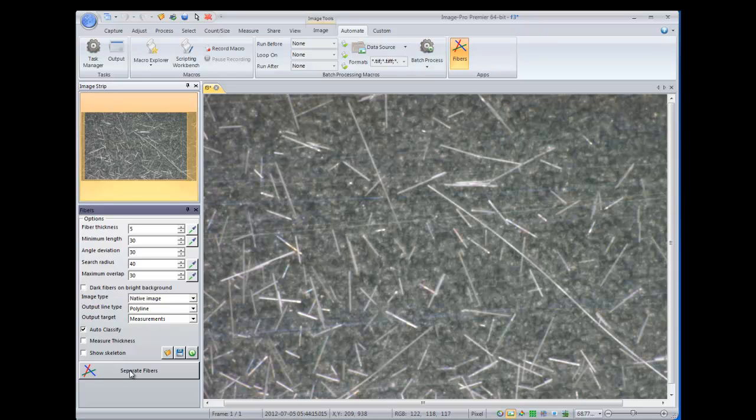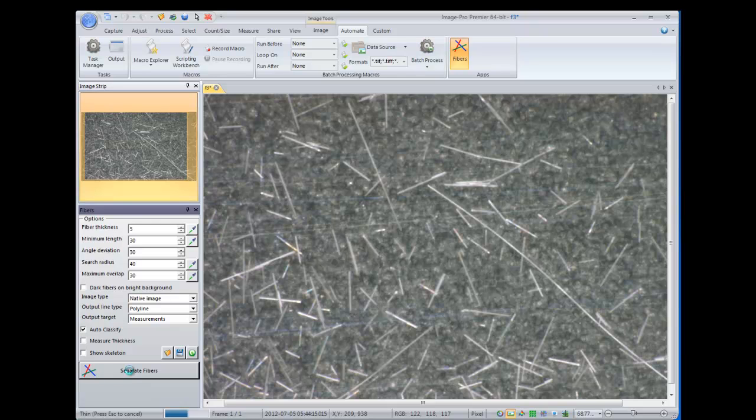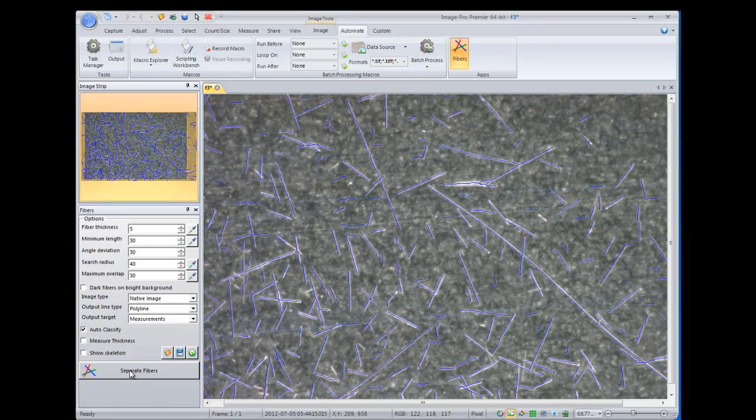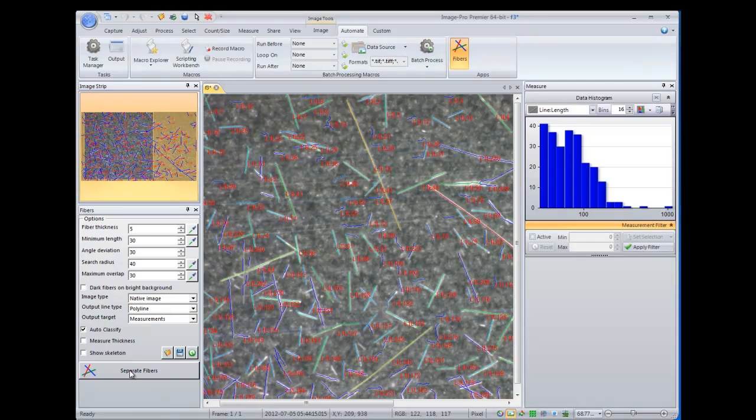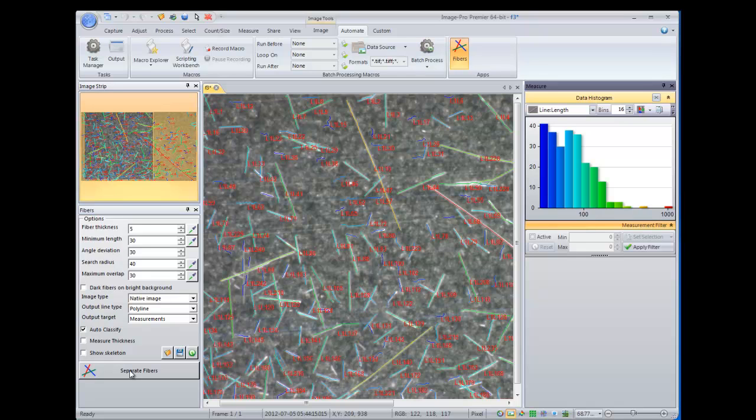So we'll go ahead and click the Separate Fibers button, and that'll walk through the analysis steps. And once it's done, you can see that it has segmented all of those overlapping fibers.